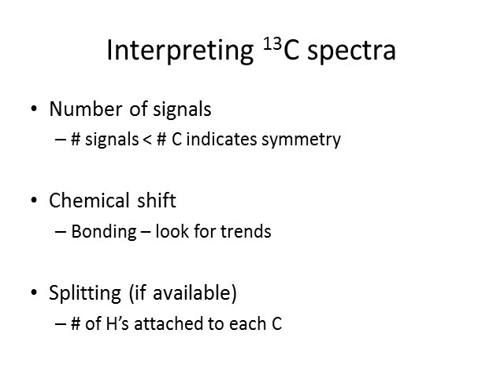The second thing we addressed in our previous presentation was what that x-axis tells you, a little more specifically. Not just that those carbons are different from each other in terms of the bonding environment around the nucleus, but it also tells you about the bonding environment. sp3 hybridized carbons come in one general area of the spectrum, and sp2 come in another general area of the spectrum. Also, electronegative elements nearby will lead to a shift within those general areas.